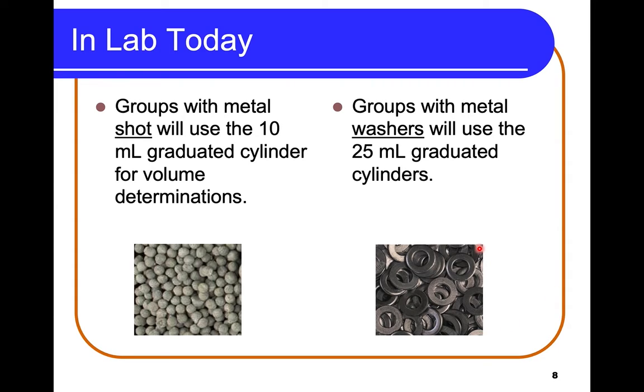If you have the washers, they are, because of their shape, too big to fit into the 10 mL graduated cylinder, and therefore you will use the 25 mL graduated cylinder.